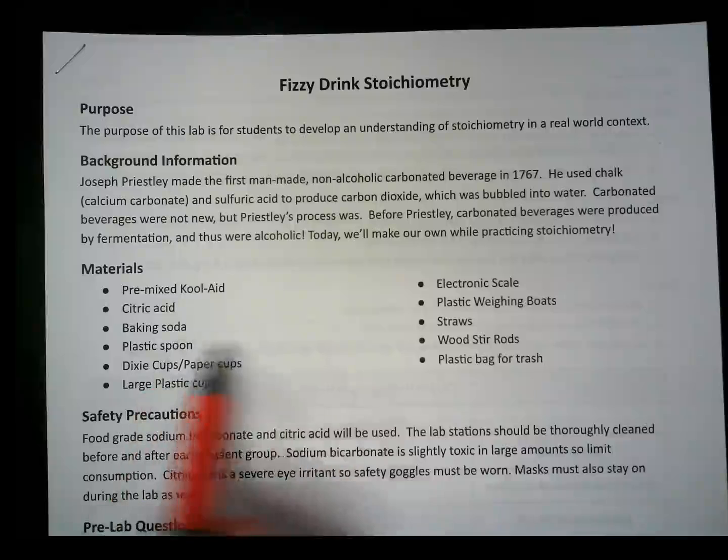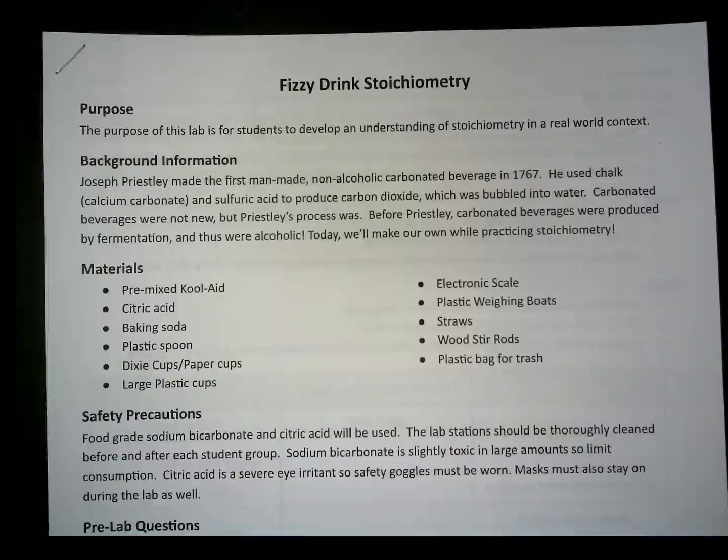So here are all of our materials that we're going to be using. We've got Kool-Aid, citric acid, baking soda, plastic spoons, all this stuff. We can read this out on your own, and we'll see where we're going to use it here.